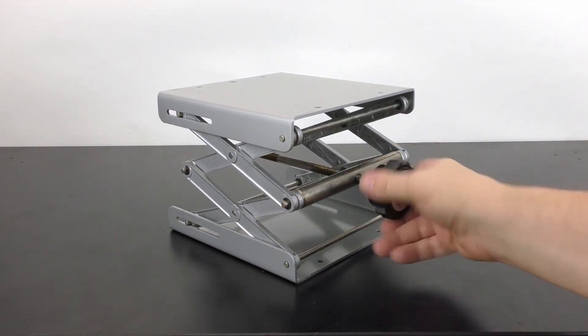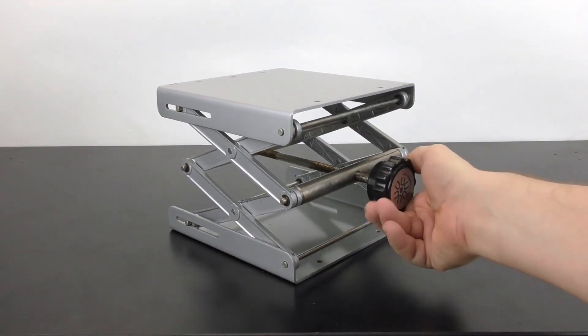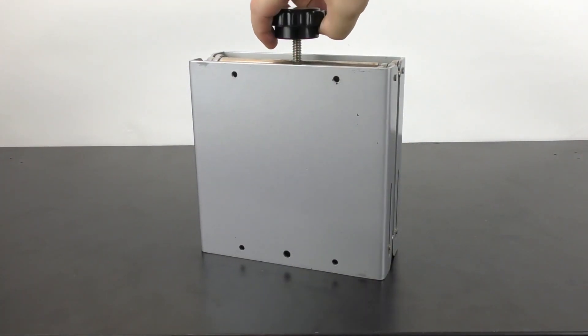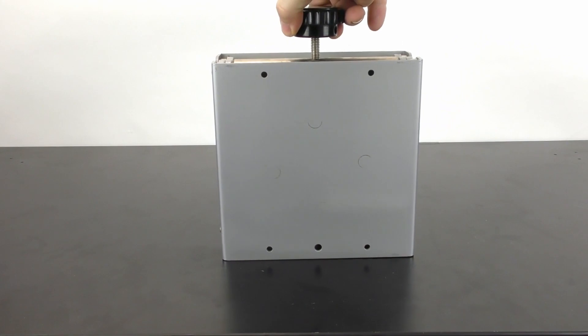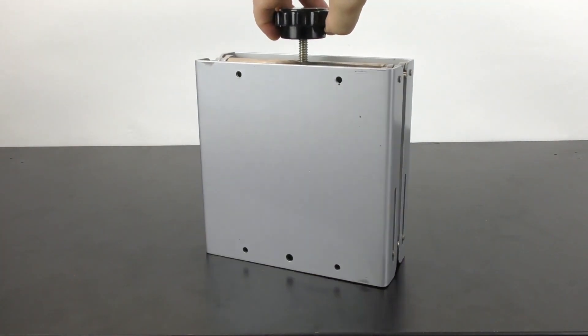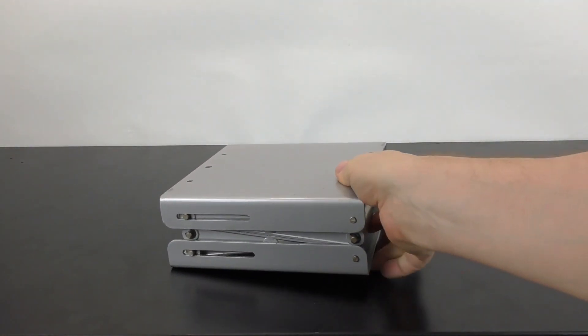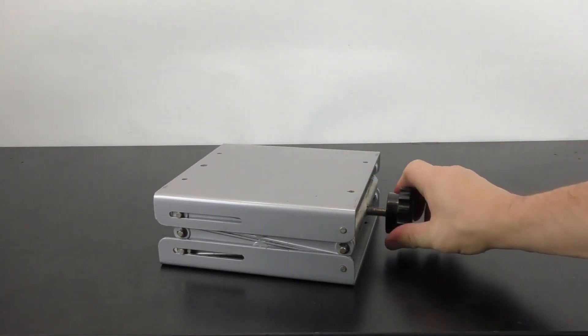The scissor jack design allows you to adjust the height simply and easily with a simple turn of the knob. There are holes on the top and the bottom if you wish to mount other support stand hardware, but it does not matter which orientation you use the lab jack in.